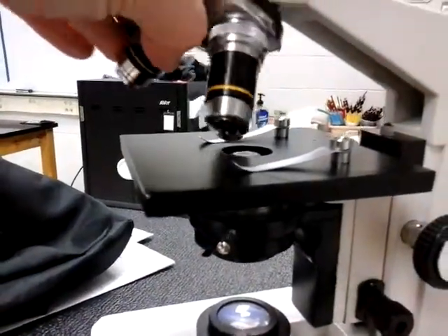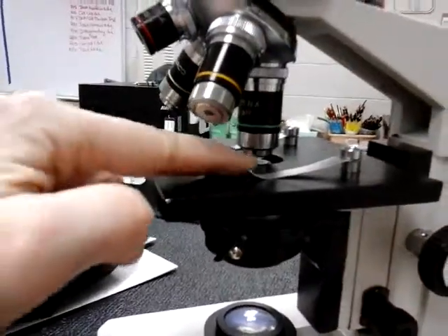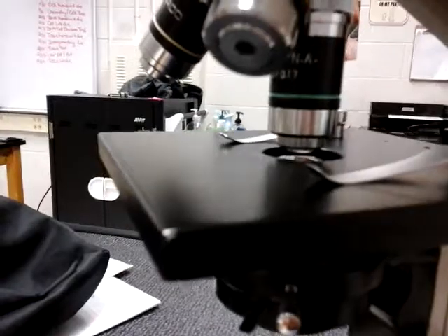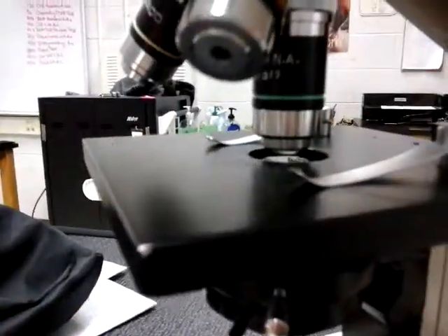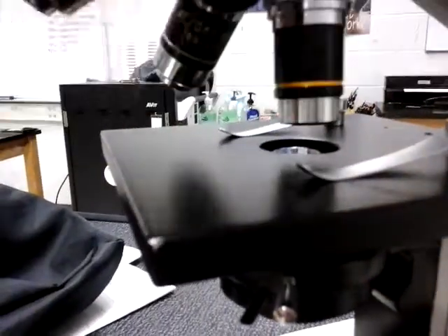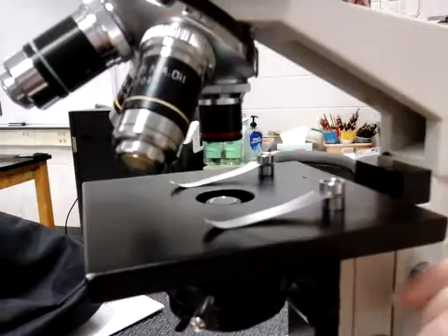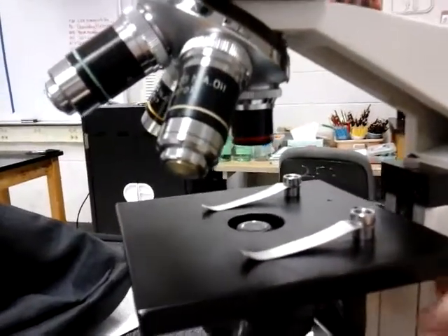Because notice when you're on high power, whoop, there is no space. I can't even get my fingernail underneath there. So you don't want to change the stage when you're on a higher power. So you only use the big knob when you're on low power. And like I said, the big knob moves the stage up and down.